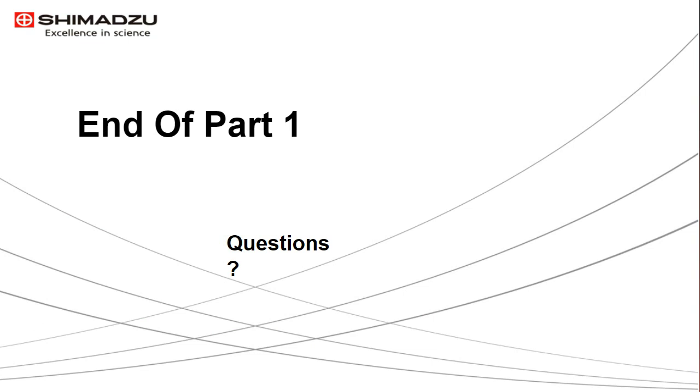All right, let me look at the first question. Here it is. It looks like sphere size is more a factor for transmission data than for reflection data. Is this typical? Yes, it is.